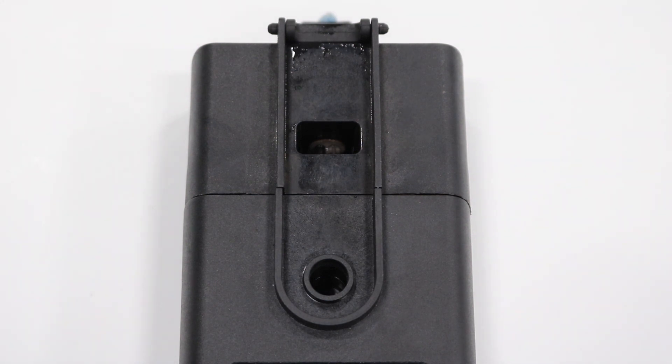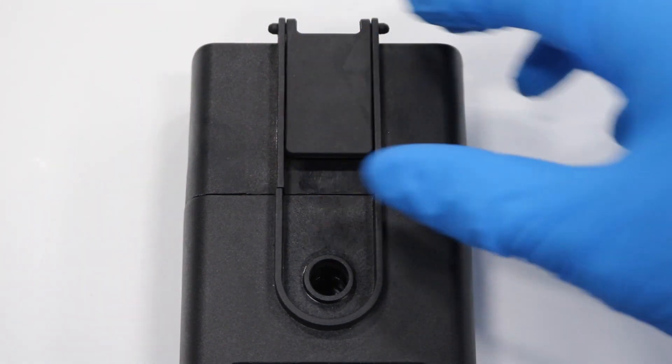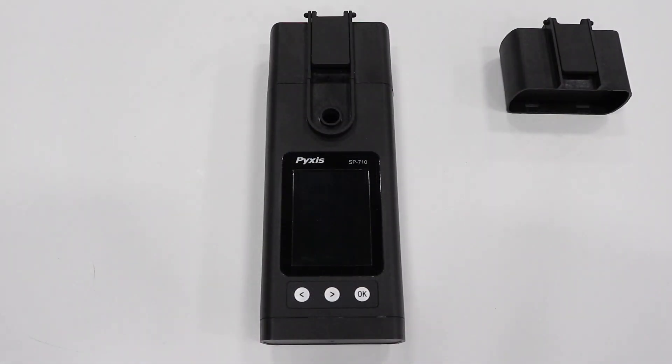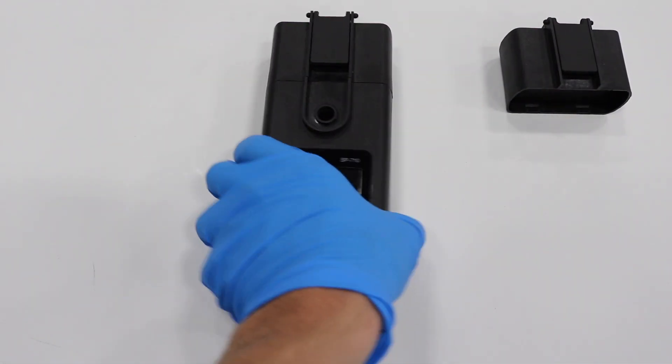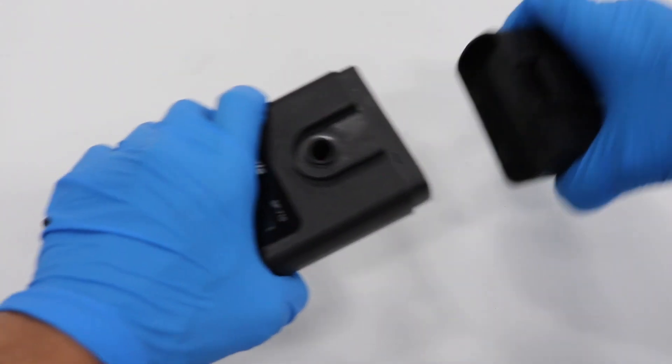When removing the old module, make sure that it is powered off by shutting the lid in order to continue. Start by simply removing the old PHORP module from the top of the unit and placing the new one on.